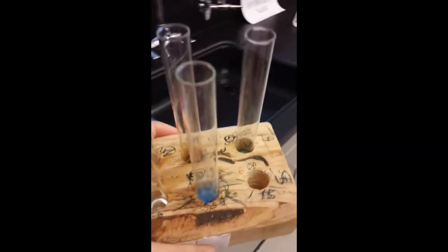Remember, don't ever leave anything blank. Say exactly what it looks like. One word is never okay. Okay? So now, I'm going to bring this back over to my directions because I always in lab make sure that I follow my directions.